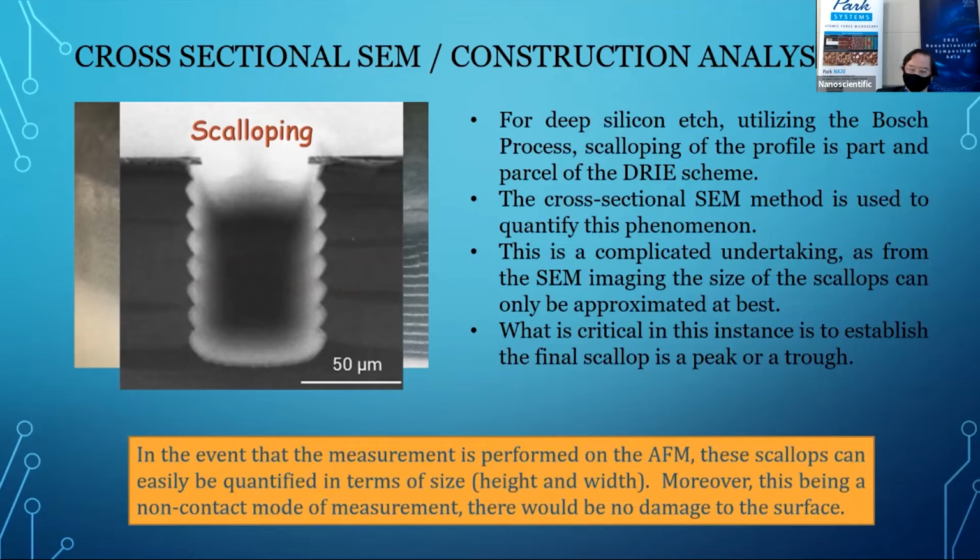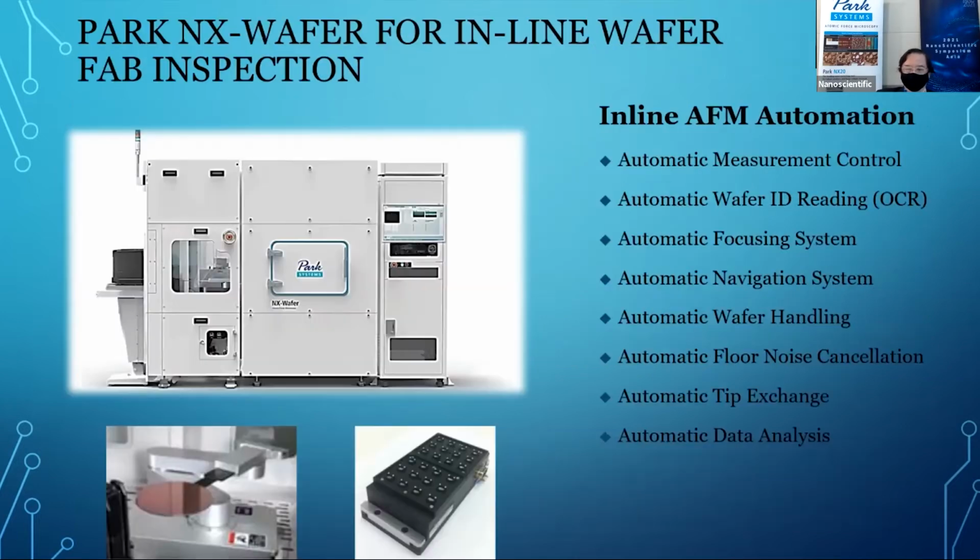Now, one key factor that we talk about is aspect ratio. I will discuss that later on in my talk, but for this particular instance, the AFM tip would definitely be able to get in because the aspect ratio is almost 1:1, give or take a bit. So the depth is also of concern. Again, I will talk about it further later in this discussion.